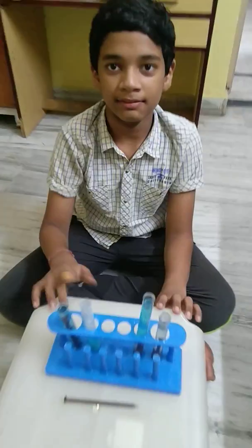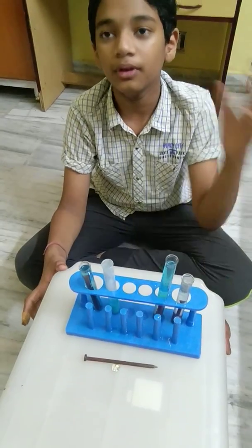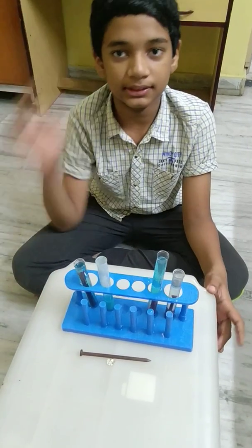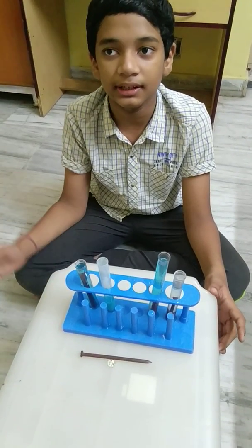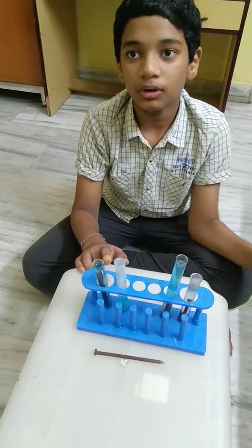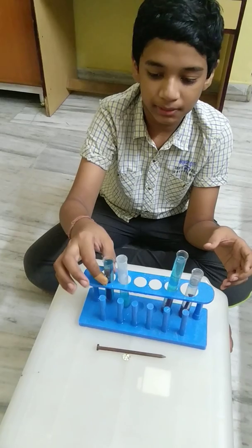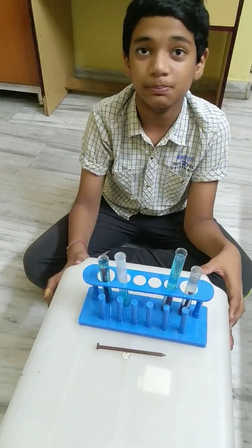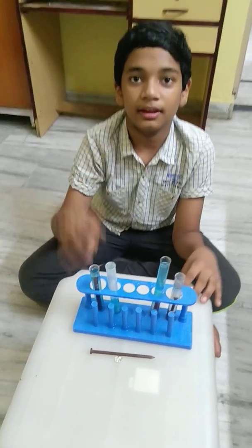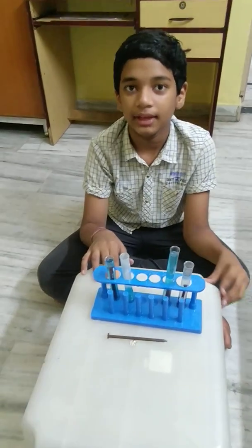Today we have learnt about displacement reactions, where a more reactive metal displaces a less reactive metal. In this case, iron is a more reactive metal than copper, so iron has displaced copper, and in a short time it will form iron sulphate. Thank you.